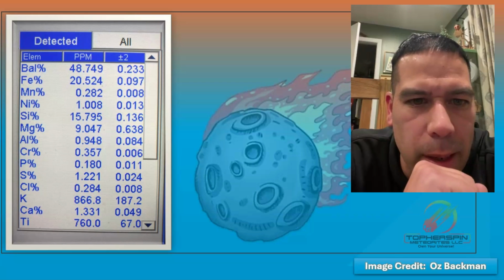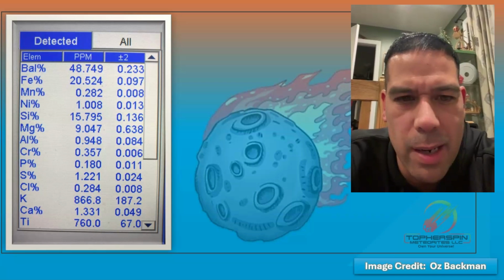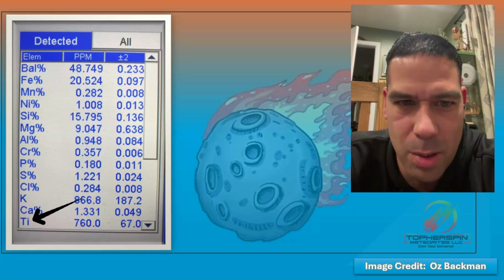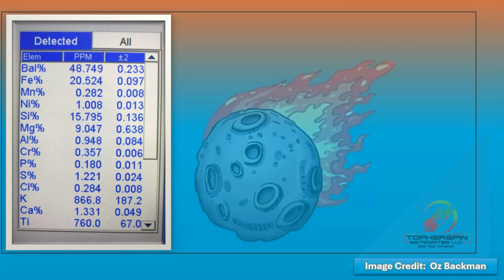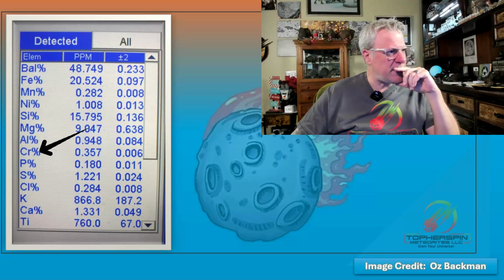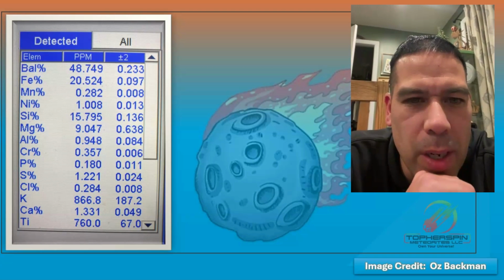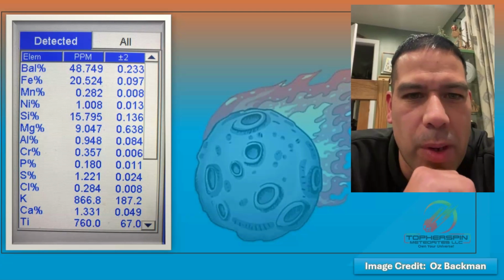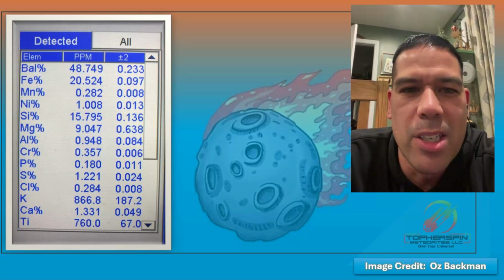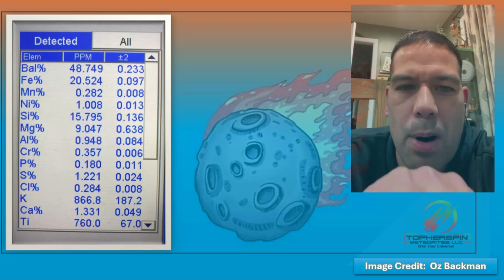So this has readings in here that look decent, and nothing stands out as crazy. No super high titanium content. We see nothing in there, no gold. We see chromium, Cr, in there. Is that what I'm seeing at 0.3? Yeah, that's chromium. Okay. So to me these look like good readings. Again, I am not a world-renowned reader of these things. This is like the 101 level: are the readings within par for what they should be?